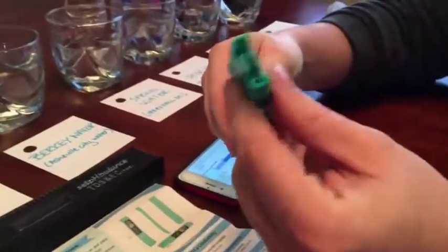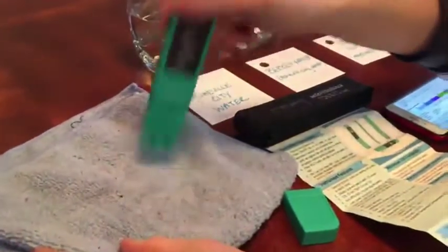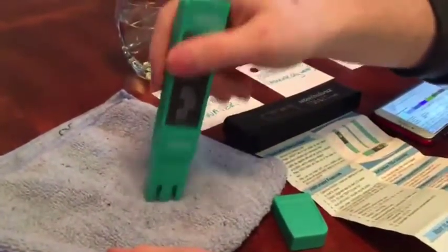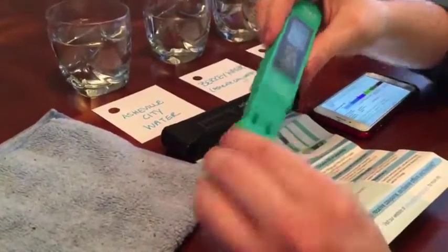Following our directions, we have a protective cap here that we remove. And you always want to just be protective here of your tips. You do have a little bit of plastic here, and you don't want to drop this anywhere. You don't want to drop this completely in solution. Just try to be protective. After you're done using it, you want to try to dab out some of the water and let it dry before you put the cap back on to store.